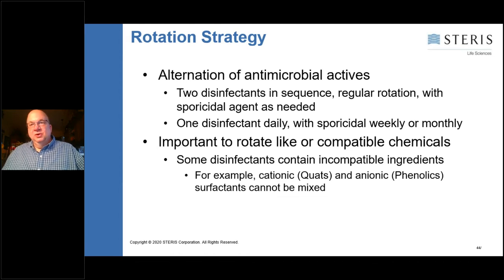I would never recommend, though, rotating two disinfectants in the sense that I've decided I'm going to rotate a phenol and a quat without a really good cleaning and rinsing step in between. And the reason being, the ionic charge of the surfactants in the quat and phenol are different. So the phenols have an anionic charge, the quats have a cationic charge, and they can come and bind together, making a black sticky residue that's very hard to remove. So either go with phenols or go with quats. I would not recommend both of them on the same clean room surfaces.